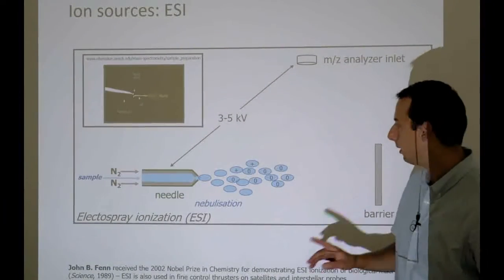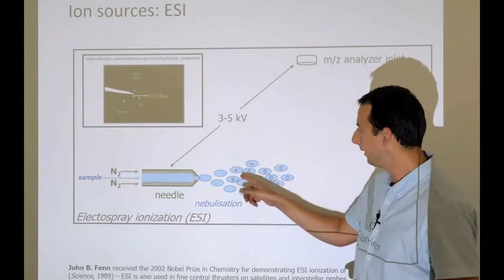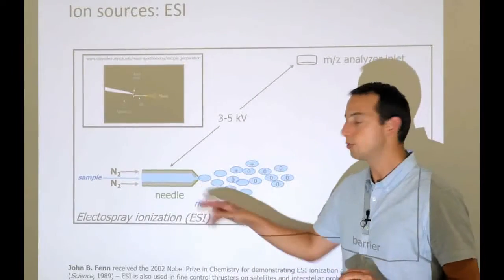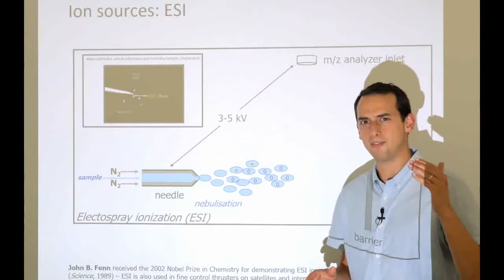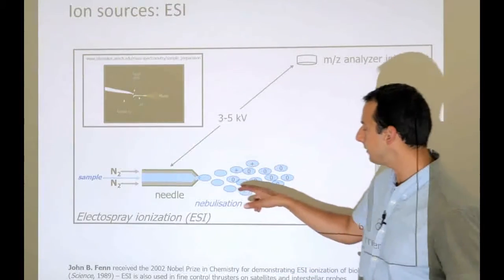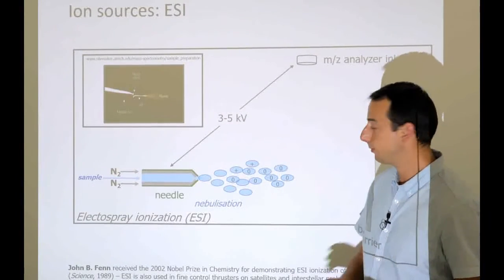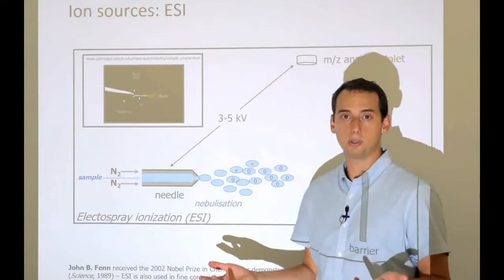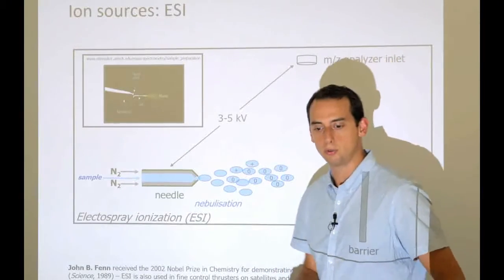Now, what is different with MALDI is that here we actually try to have the analyte molecules charged already inside the liquid. We do that by adding a little bit of acid to the liquid so that it actually has a pH of about 2. And that means that most of the sites will be protonated. Remember that very few things had a pKa below 2, so everything tends to be protonated, even the acids. And so the whole concept is that most of the analytes are already positively charged. We have droplets that contain peptides that for whatever reason we could not charge, or that contain no peptide at all, and they tend to be zero charge or neutrally charged.